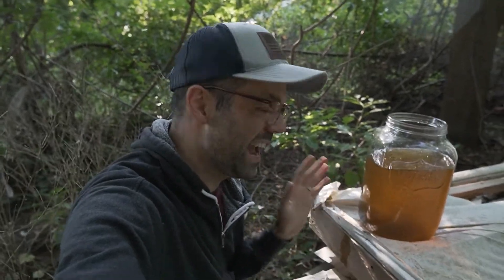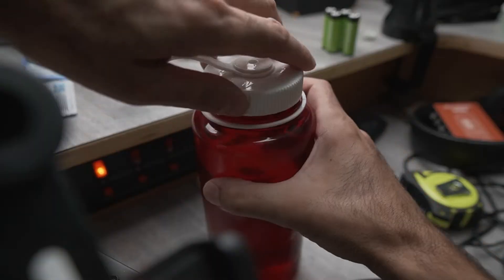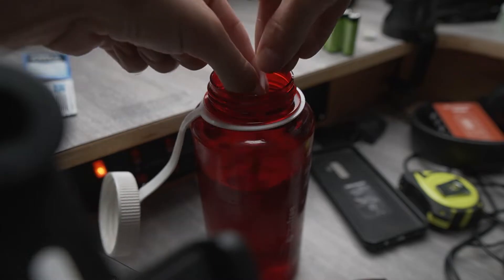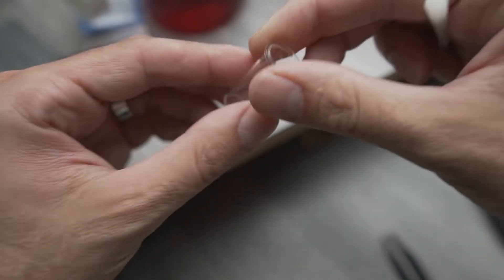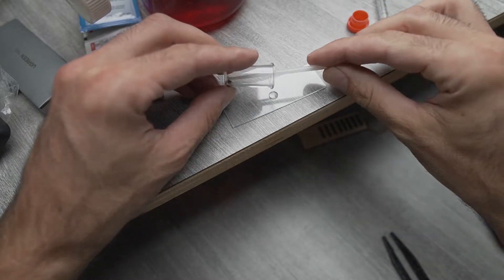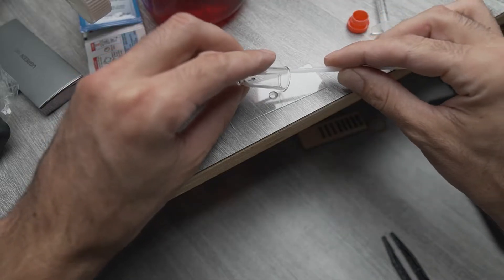Obviously you would never actually have this dirty of water to treat for drinking — we're just doing an absolute worst-case scenario, if you had to treat really gross water like this. Let's take a sample of this nasty water and check it out under the microscope. Here's a sample of some organic matter at the bottom of that standing water, just so we have a good sample of some of the microbiology.